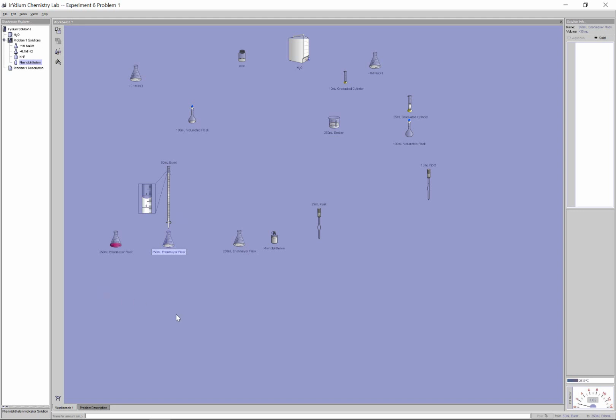I should be pretty safe tossing in just 30. So I'm just going to type in 30. Basically what you would do is you would line up, well, I'm about 4.30, past 4 would be a little bit past the 30 mark. You just pour that in there. If I've done that right here, good. So that sort of saves me a little bit of time here.